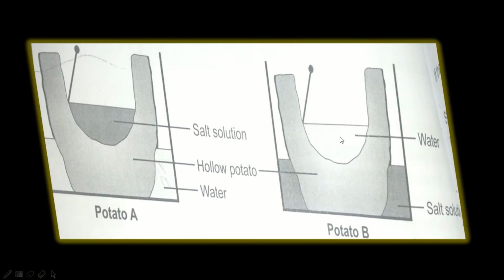Whereas in potato B, you actually have your tap water. And then in both our potatoes, we have a pin to show where our water, or rather our solution, ends. All right, so let's move on to our results.